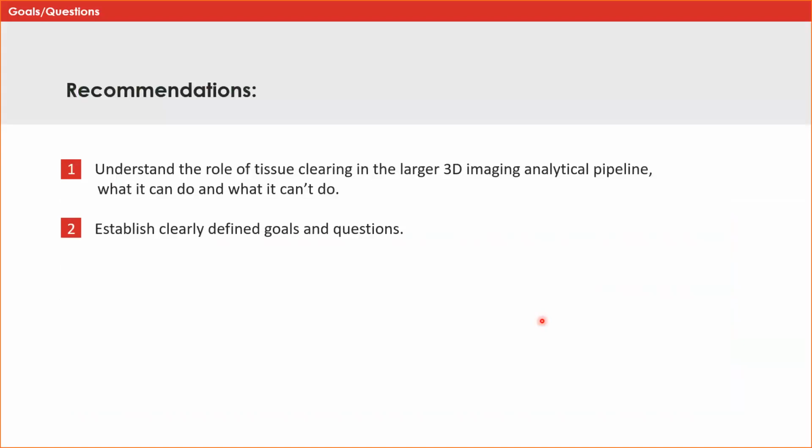include to be sure that you have clearly defined goals and questions, understand the role of tissue clearing in the larger 3D imaging analytical pipeline and how tissue clearing can help you achieve those goals, and just as importantly, how tissue clearing cannot.